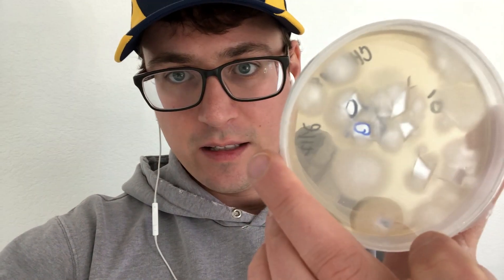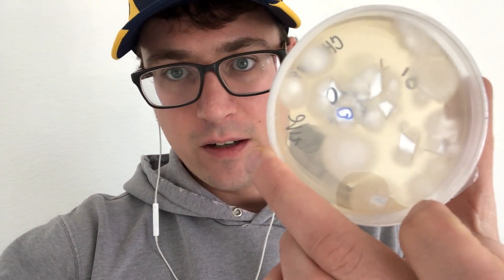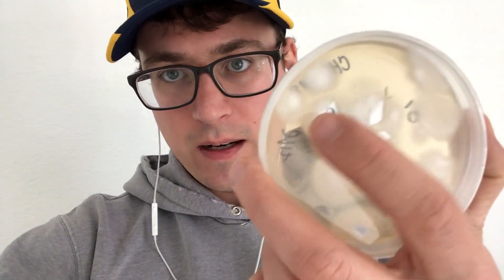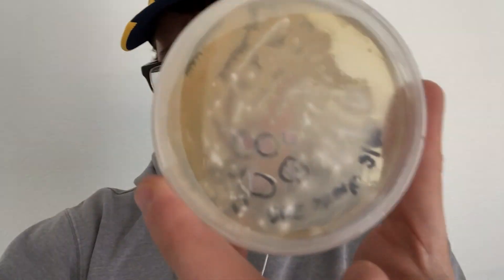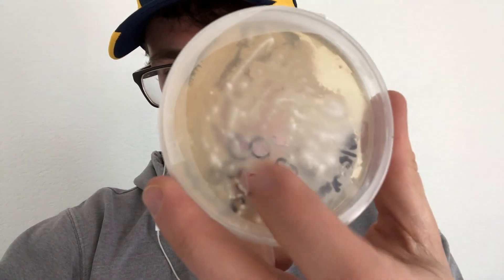This is all the different chestnut spores that the isolates grew out, and you can see on this plate there is definitely a diversity. This one's kind of flatter and less cottony, and then these two up here are nice and bright white. On some of the more dense plates you can see a little contamination, but all the different types of chestnuts forming. On the even more dense colony you can see a little bacterial contamination setting in, but we got all the isolates before any of that got overgrown.